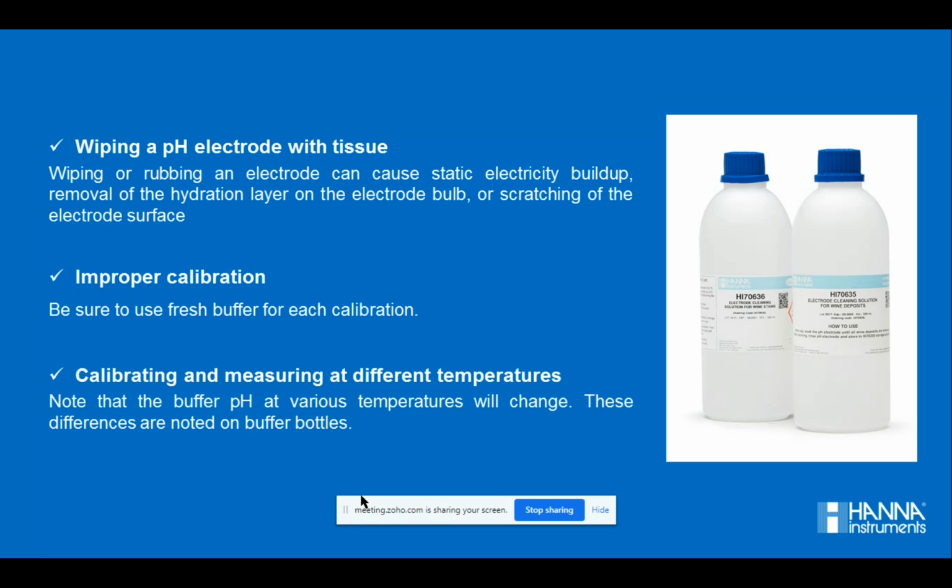An improper calibration can lead to inaccurate readings, because calibration is not only done to nullify the errors due to regular use or any manufacturing defect or attack of the sample, temperature, and anything else, but also it is calibrated in order to get proper readings.